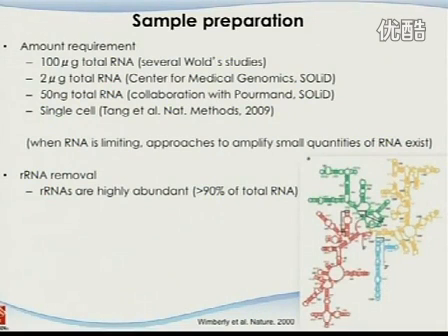And then I mentioned this ribosome removal issue, and he said, well, since our genome is so small and it's bacterial, and we use 1 lane of Illumina, it should be plenty. Even though 90% is ribosome RNA, we get rid of it, and we just analyze the remaining 10%. We still can cover this genome pretty well.